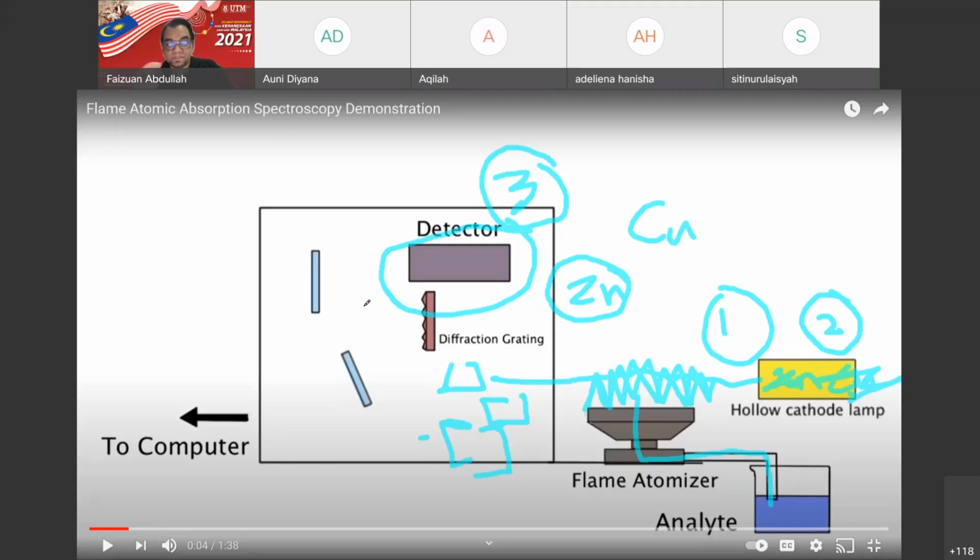All right, I only wanted to remind you of the topic that you have learned, I think, in the analytical chemistry course, on the AAS concept. That is the basic concept of AAS. We have three important parts in the AAS.